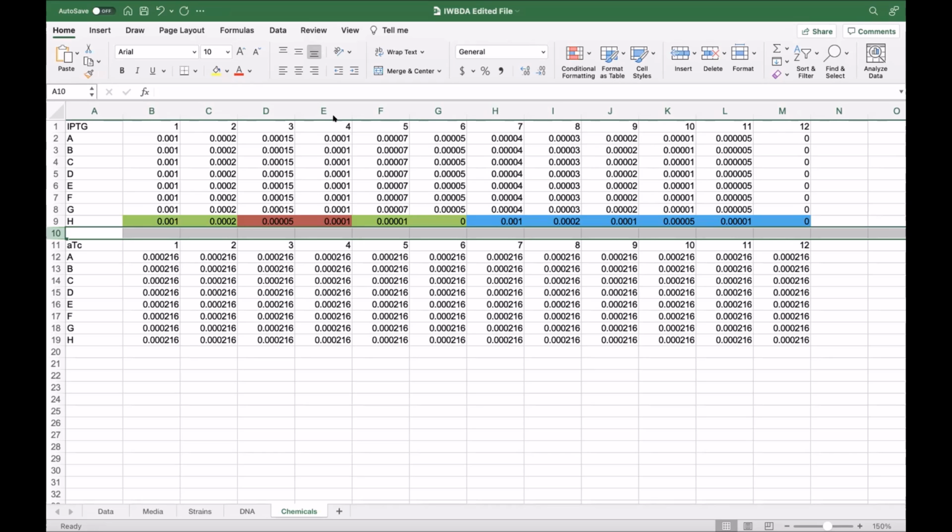Could you speculate? So let's say that we did want to expand the model overall, right? So we have strains, DNA, chemicals here. Let's say I want to add a different kind of thing that's not a chemical. Let's say proteins. In the assays that we do, we often have very specific proteins that we're testing. So there's a DNA, and then there's a protein that would be separate. What would it take to extend the model to include that?